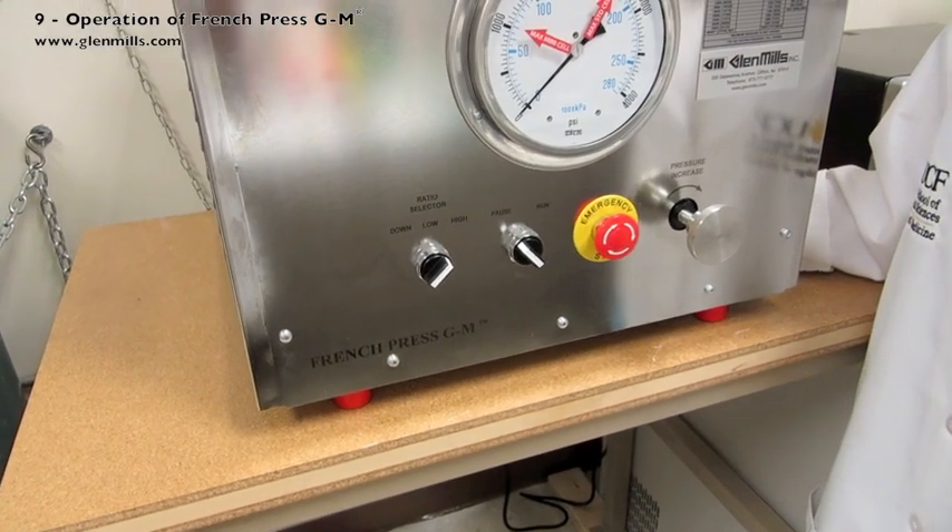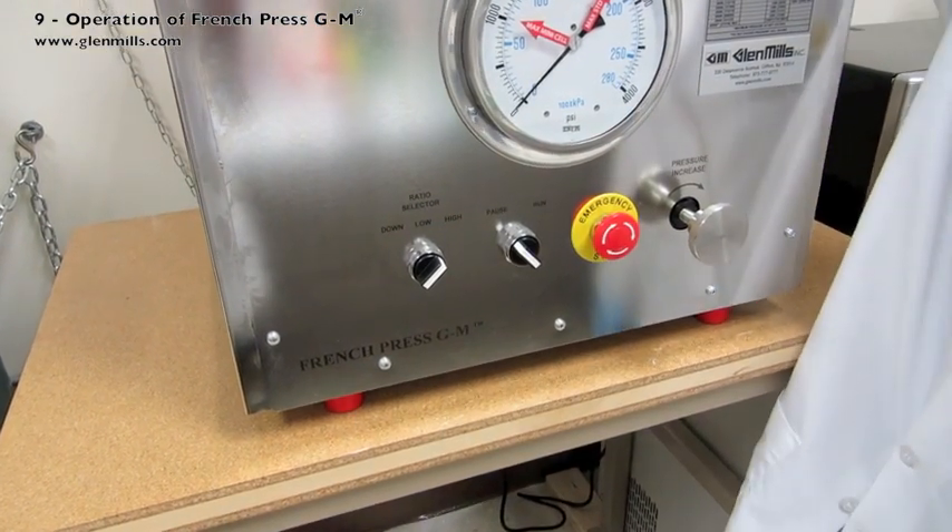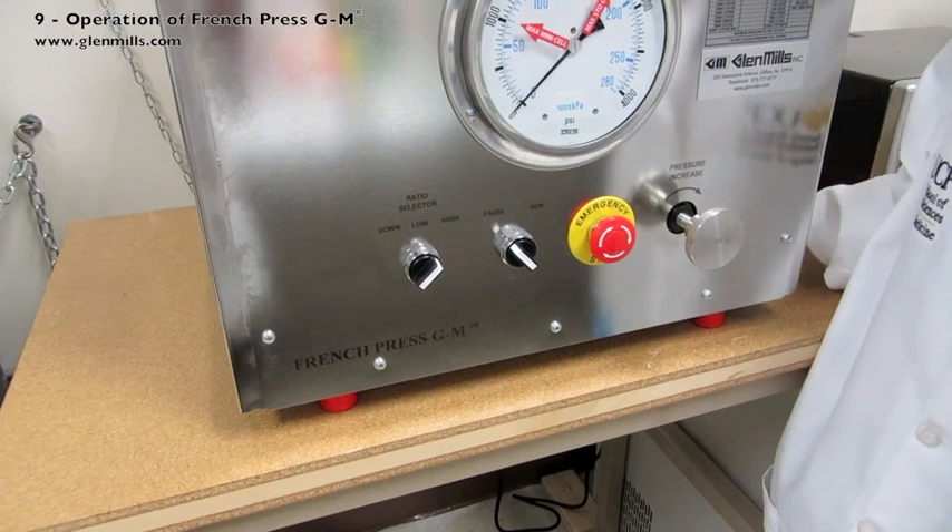This is the setting used with a 1-inch standard pressure cell only. This high setting is not used with the mini cell.